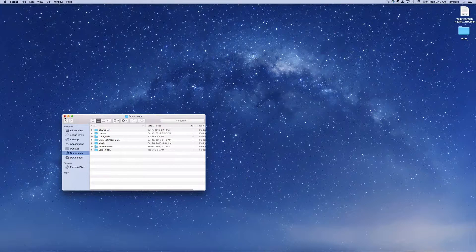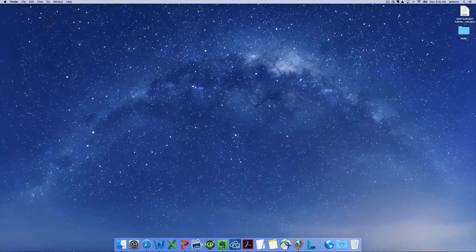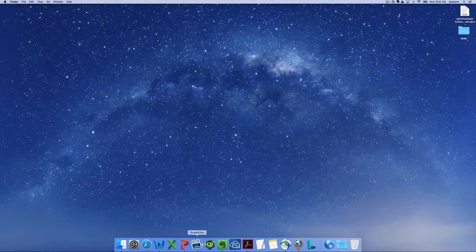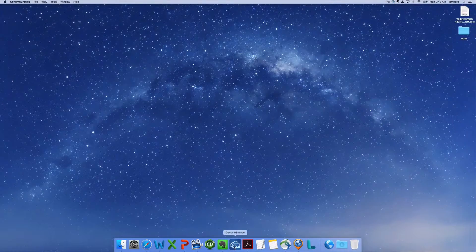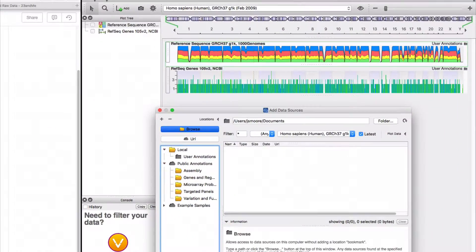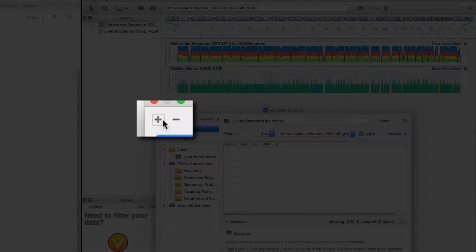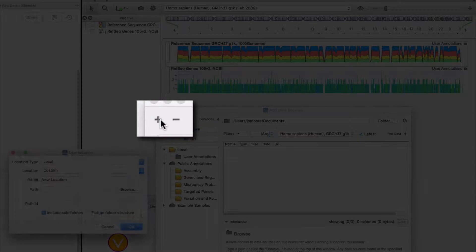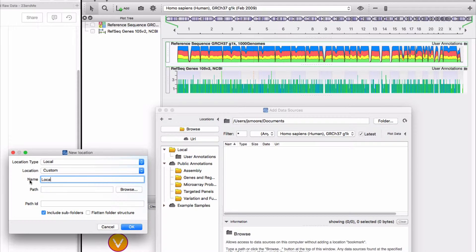Now launch Genome Browse. Use the add button to bring up the add data sources window. Make a bookmark to your newly created local data folder. Name the bookmark local data.